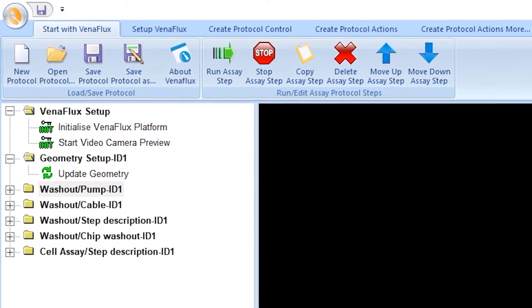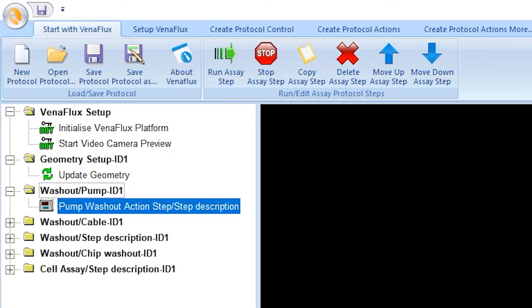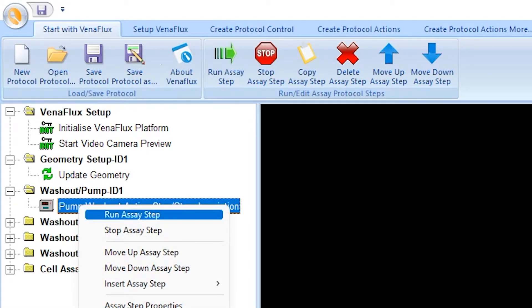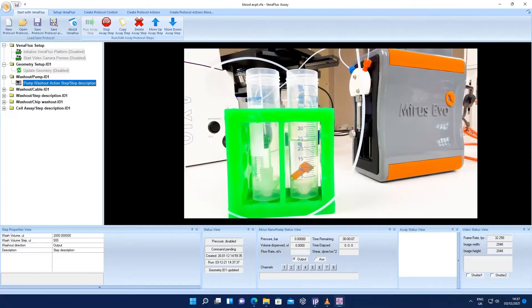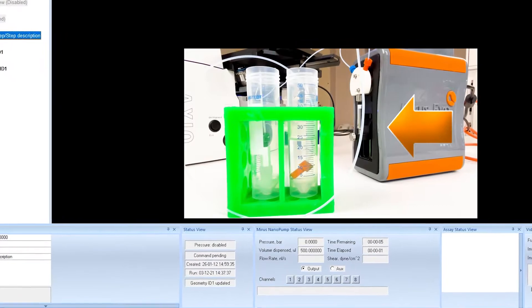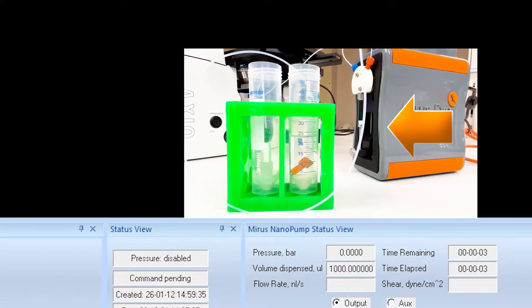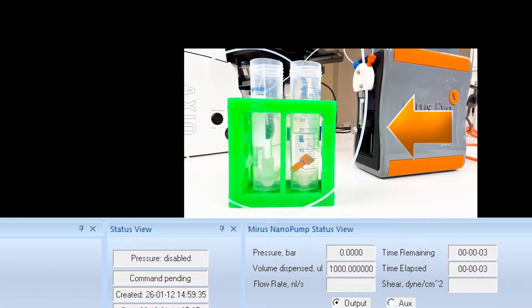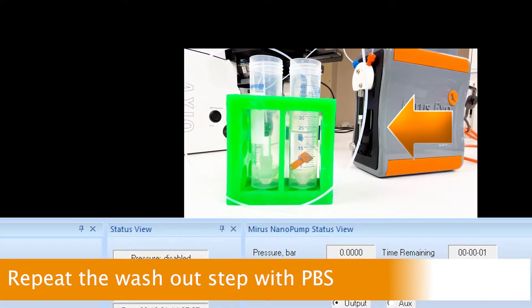This reveals the step properties with the following default settings. Wash volume is 2000 microliters. As the syringe volume is 500 microliters, this means that the syringe will refill 4 times to complete this wash step. Right click on Pump Wash out Action Step and click Run assay step. The pump will pull or aspirate ethanol into the syringe and dispense it into the waste tube. The status of the MyReceivo pump can be viewed, showing the volume dispensed from 500 to 1000 to 1500 microliters until it finally completes the washout of 2000 microliters. This washout step is then repeated with PBS.